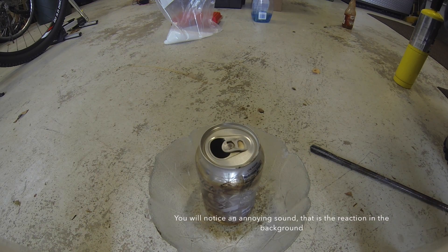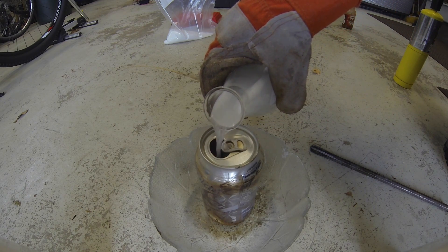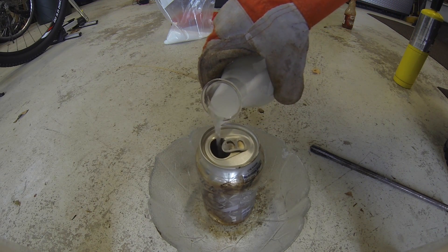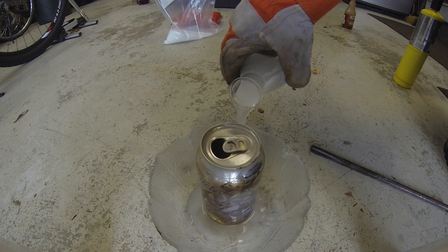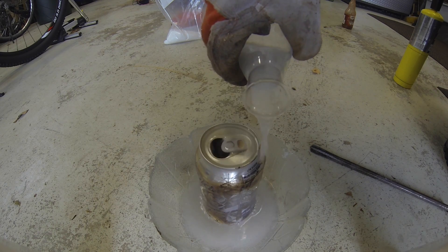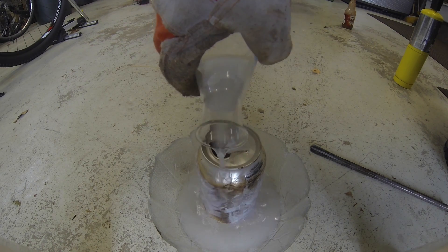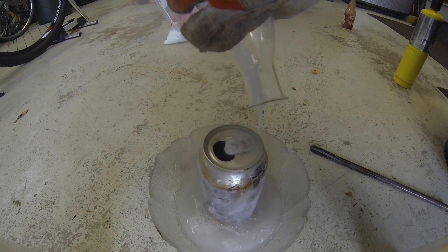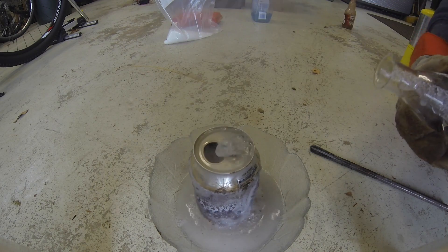This is pretty much just the experiment going on — I just let it record and we'll see what happens. Right now we're adding the sodium hydroxide solution a little bit inside the Coke can, and you can already see that it's vibrating and there's a heavy chemical reaction going on. As it goes over the sides, you'll notice there's a vapor coming off, and it's just reacting very violently.